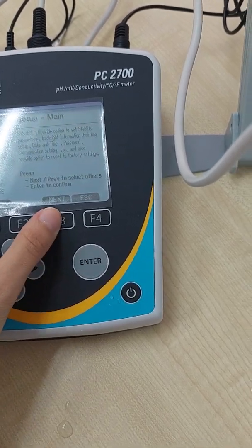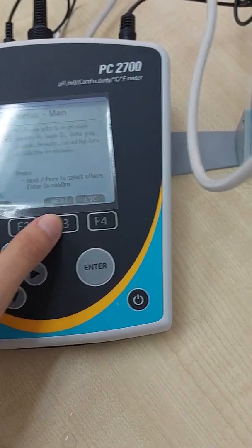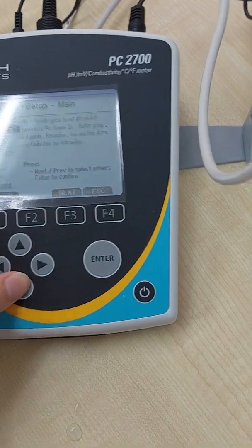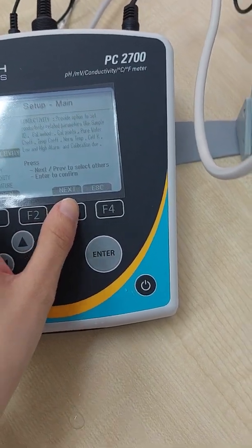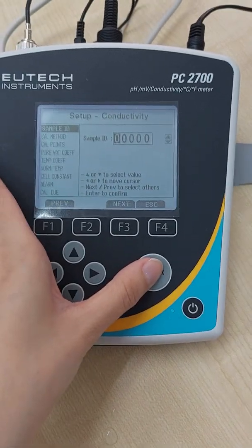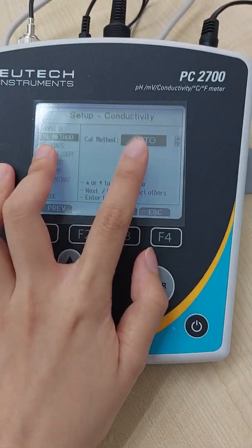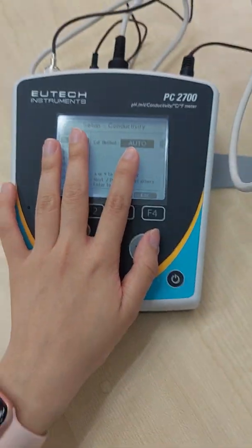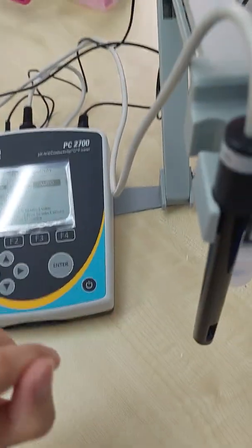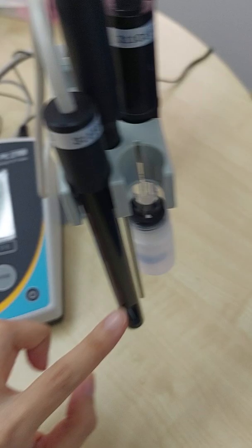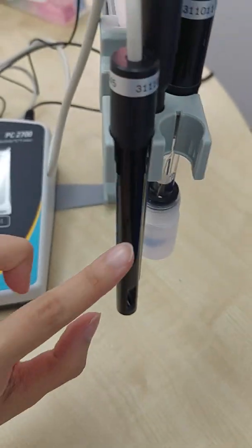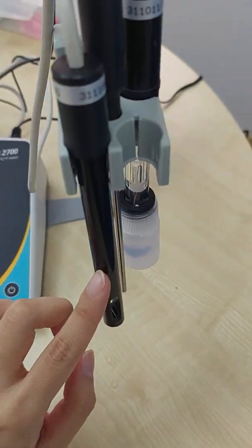Then we can go to conductivity. So conductivity, usually we will go for auto mode, meaning that if we do calibration one four one three, it will automatically set the point to one four one three.